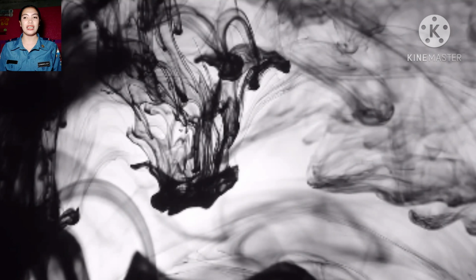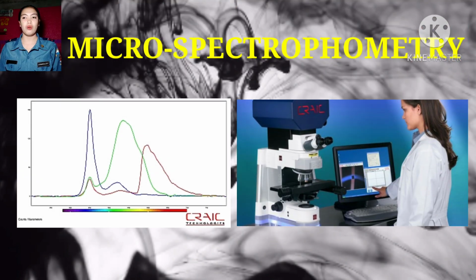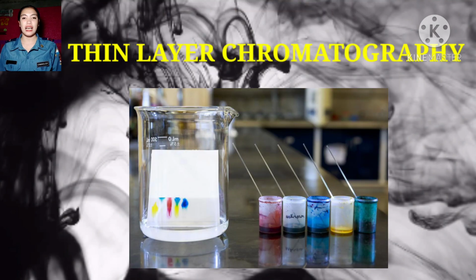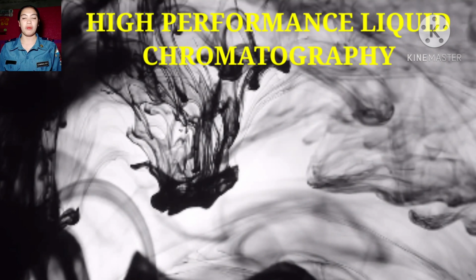In ink analysis, there are three methods to be used. First is microspectrophotometry. This is the way of discovering the true color of the ink. These are machines used to determine the color of the ink through the use of ultraviolet or infrared light. Second is thin layer chromatography. This is a method for analyzing a mixture by separating the compounds in the mixture. So, TLC can be used to determine the number of components in a mixture, the identity of compounds, and the purity of the compounds.